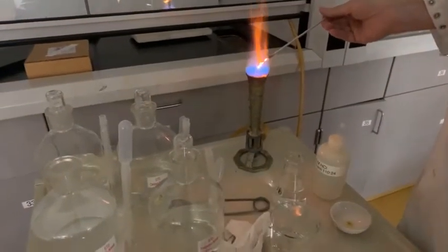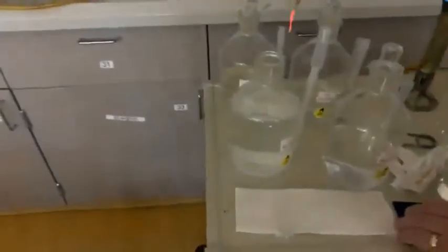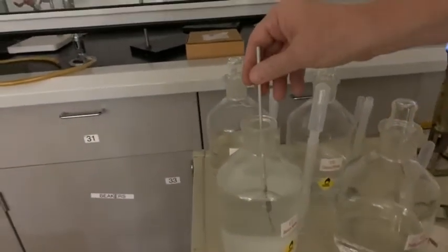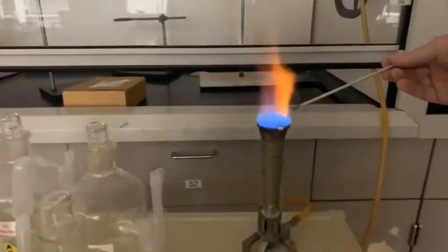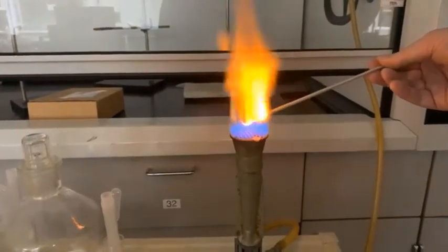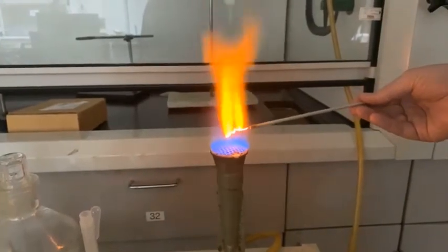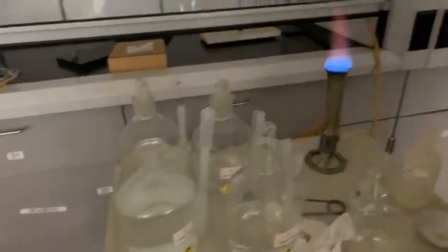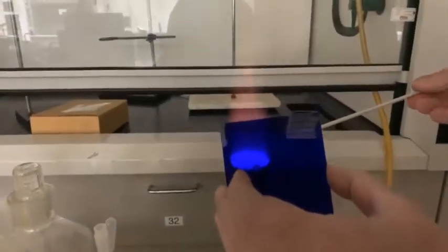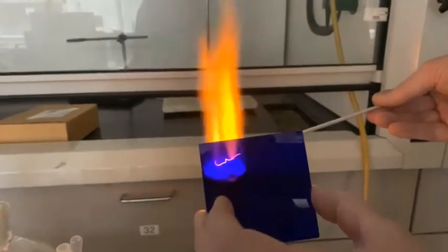All right. We want to show you the barium flame. Barium flame has a distinctive yellowish green color. So without the lens, you see that bright yellowish green kind of popping. They call it a greenish color. To me, it looks yellowish green, and it's basically gone. Through the lens, it gives a ghosty look. Through the lens, you see the flames are a brightish yellow color, or whitish. Okay, time to clean again.